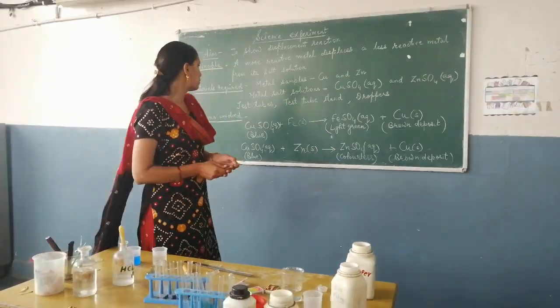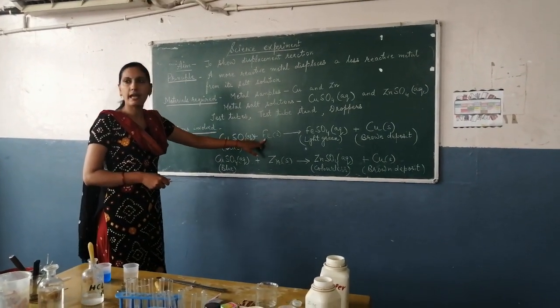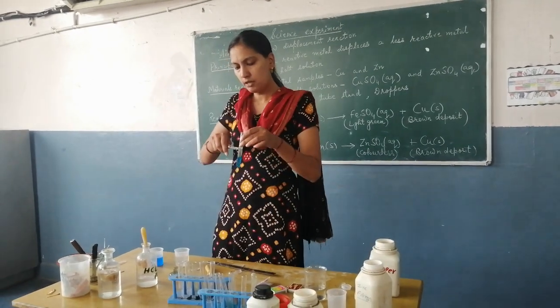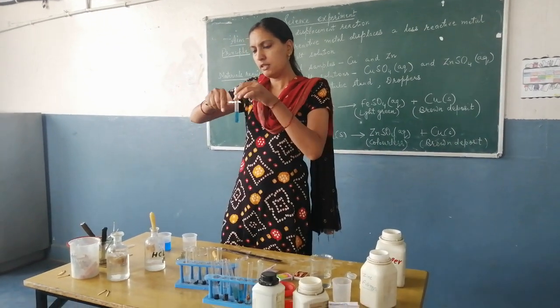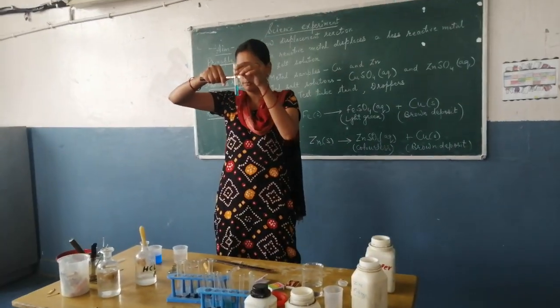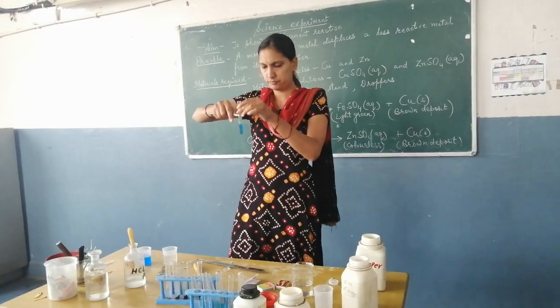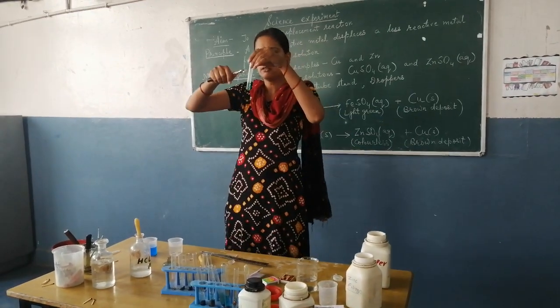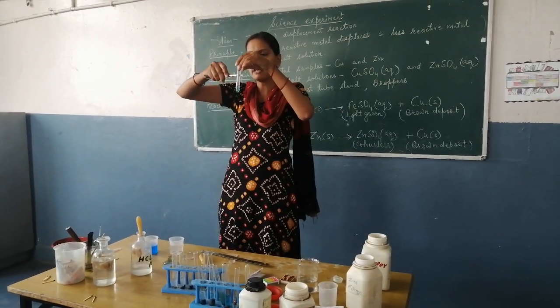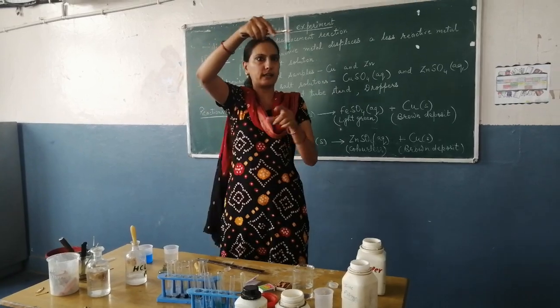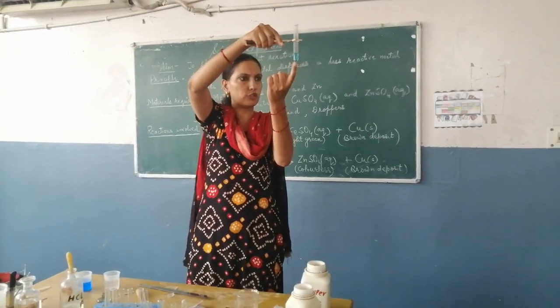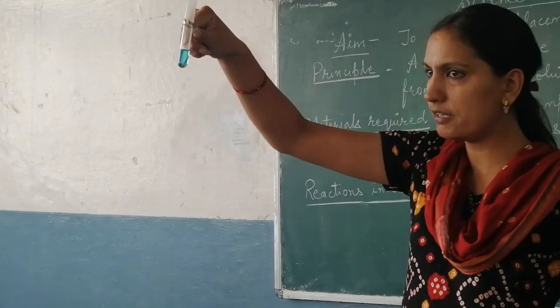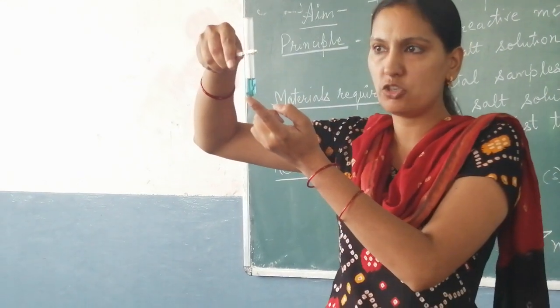First of all, I will show you how copper sulfate solution reacts with iron. I have already performed this experiment and I will show you the result. This is the copper sulfate solution, and I have kept some iron nails in it. You can see the iron nails in this test tube, and its color has been changed.